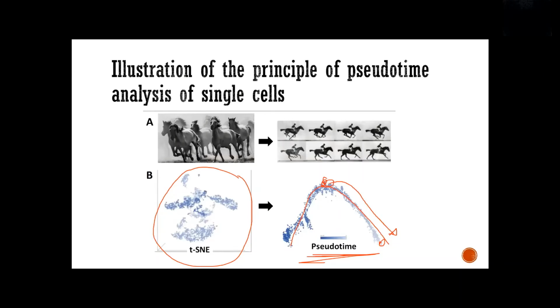Professor? Yes. Do you ever see branching, where you'd have two different branches or two different end cells? Exactly. Very good question. We will create not only a single trajectory. Probably there are branch effects. You will have multiple branches in your population. Exactly, yes.